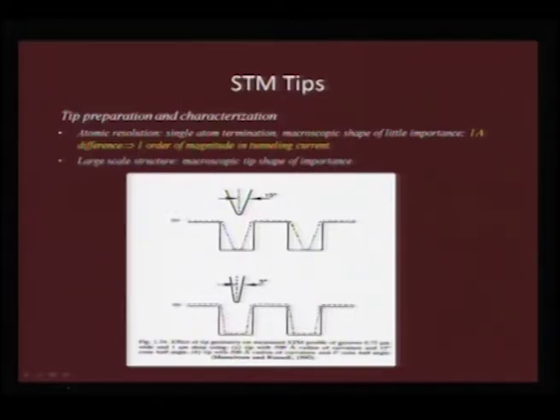But there is another issue, the tip that we saw here. This is exactly the way the tip will look, and this tip has a cone angle. If this cone angle is going to be 15 degrees or 5 degrees, you can look at the relative influence on your scanning microscopy images, because if your cone angle is 15, and the atomic surface has this sort of patches, then your probing will be incomplete.